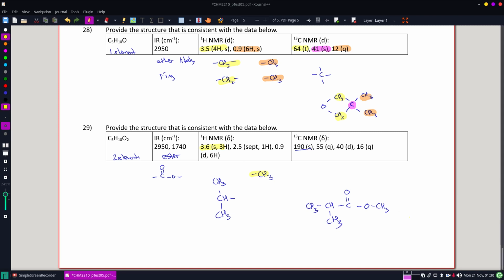And explaining all these peaks. That's the yellow. Oops, that's not a highlighter. And it's going to be a quartet, but it's going to be deshielded some because the oxygen, I bet it's this 55. Alright. And the septet is this guy right here. It's deshielded because it's near that carbonyl, and it's also that doublet on the carbon. And then our final ones, those 6 hydrogens that are very shielded, are also creating that quartet. Alright, I think that gets us done.